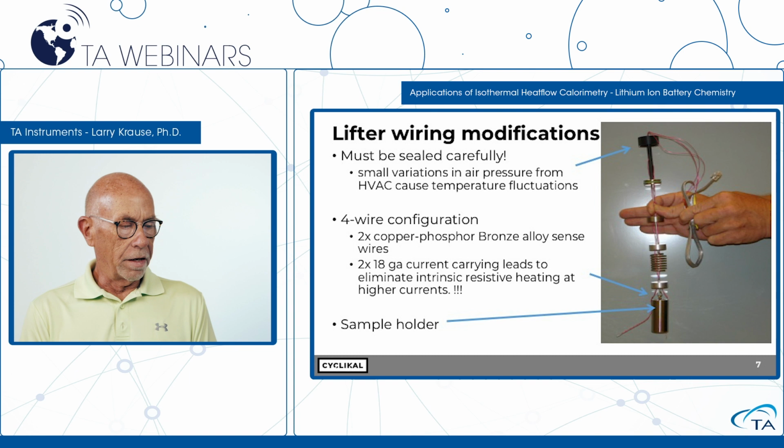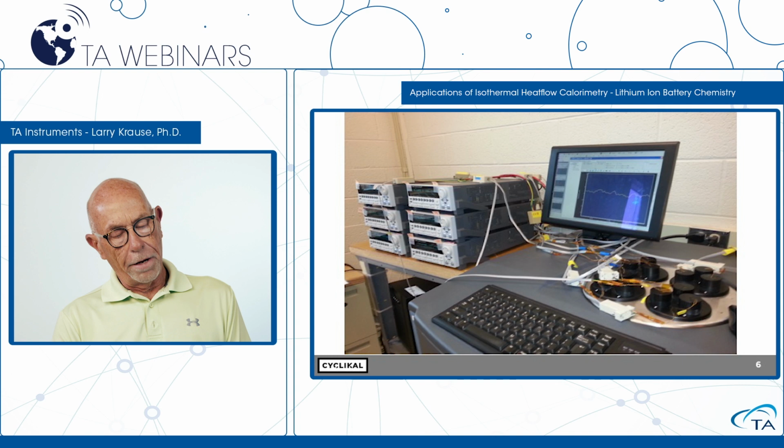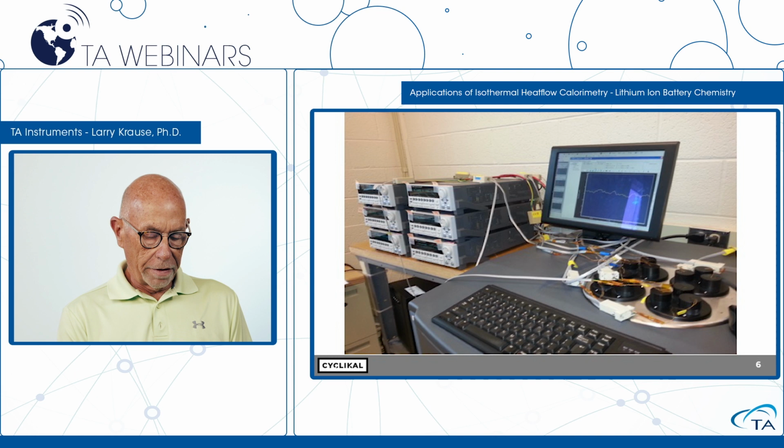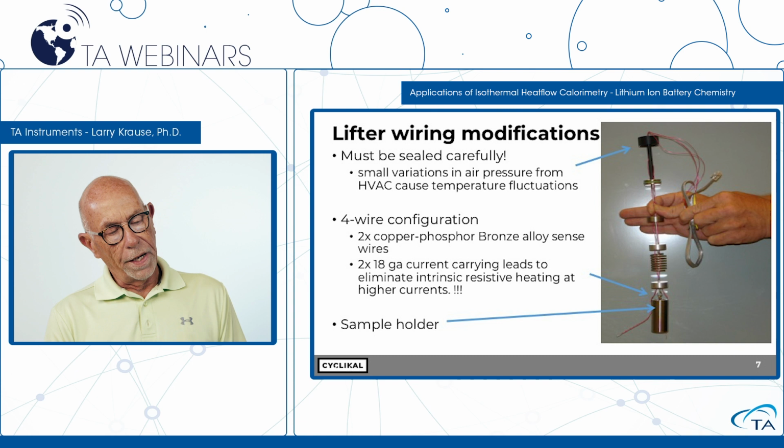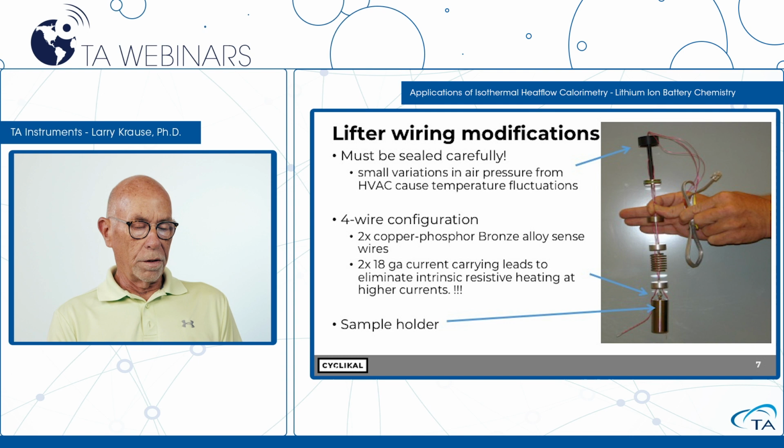Equipment modifications. The modifications we did are concerned with the lifter. So this whole thing here is a lifter. And if you go back, you can see the black cap on top. And backing up one, you can see the black top over here. So the lifter fits down inside of this calorimeter shaft. And what we had to do in order to put wires down there to connect into the battery, we put one hole in the top of the lifter cap and ran wire down the middle, two holes on the main thermal shunt here, and then holes for extending the wires down through this shunt, all the way down to the sample holder here where the battery sits inside of this stainless steel sample holder.